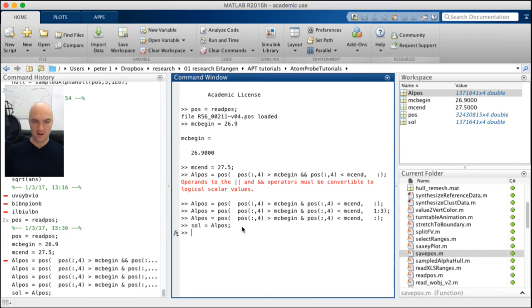Now I'll redo the scattering command. And one thing you will notice is that plotting 1.3 million points is probably not that useful, even if it works, just simply because you're not going to see much, okay? That's a lot of points floating around.